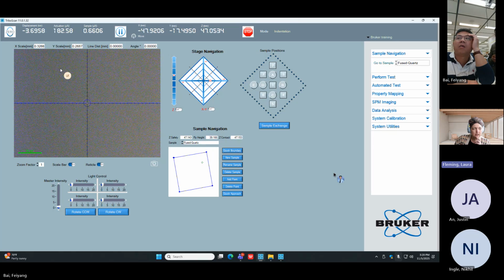What you're saying, just so I have this right, you have graphene on, what's it on? I'm sorry, graphite on copper. Graphite on copper, and it's kind of powdery in that they are 5 to 15 micron particles. You don't want to grind it down because of that powder nature, and imaging it might not be possible because the sample roughness is 5 to 10 microns.